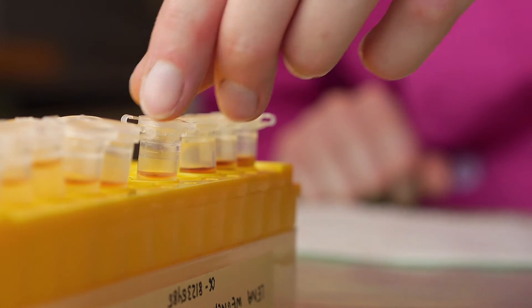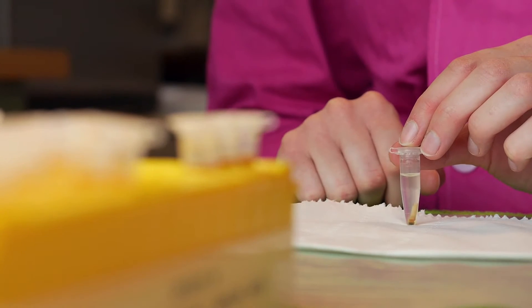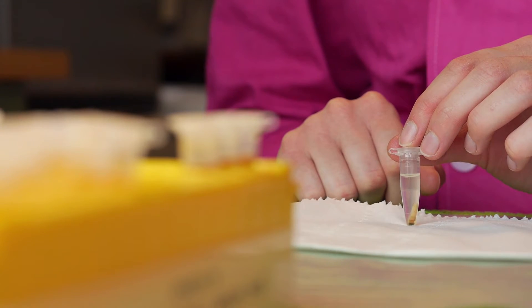Of course you can use paraffin as an alternative method and you won't have cracks, but this method is very time consuming. Therefore, we developed a method that prevents the sample from shrinking and is still quick and easy.